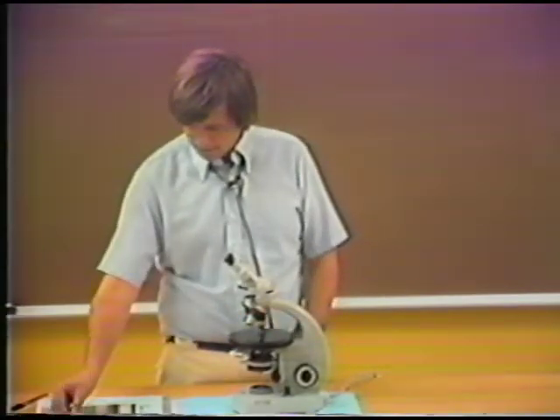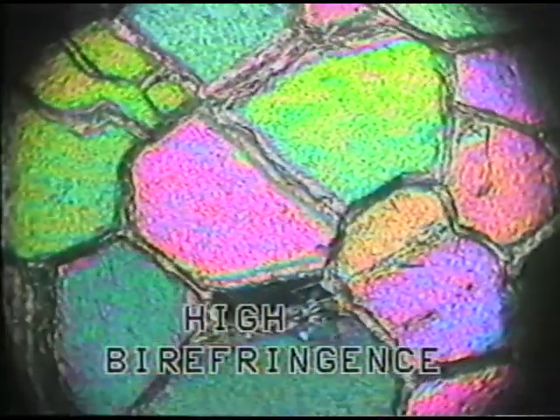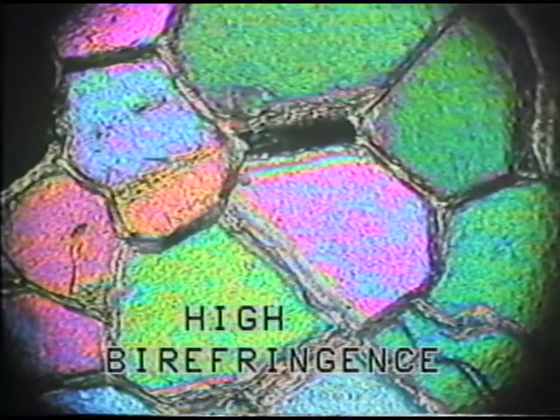Now I'm going to switch mounts to a mount of olivine. And this is a rock dunite, which is made up virtually entirely of olivine. Olivine has a much higher birefringence, and here you can see the second and third order interference colors shown by the much more highly birefringent olivine grains. And these would be farther to the right on the Michel-Levy chart, and again, given the thickness of a particular thin section, would give you the possibility of estimating the birefringence of this particular olivine as being in excess of 0.03.